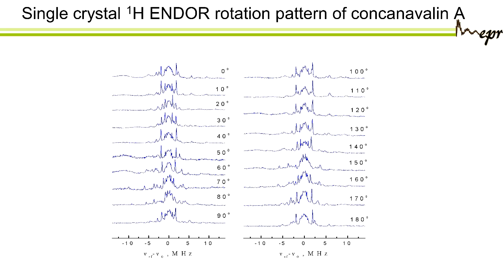And then you rotate it a bit, and you do it again, and you rotate it a bit, and you do it again, and in the meantime you pray that the spectrometer doesn't break and the helium is still there, but eventually, you know, you can do it. So then you have to sit and analyze everything.